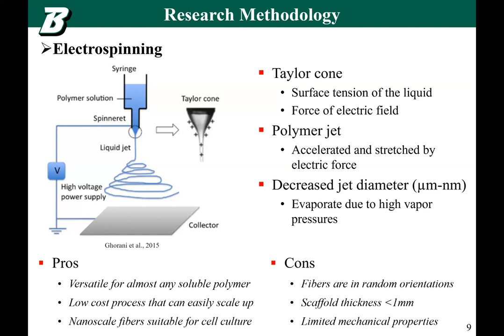The advantage of electrospinning is that it's versatile for almost any soluble polymers, and it is a low-cost process that can be easily scaled up, and the nanofibers are suitable for cell culture. Electrospinning can fabricate several tens or hundreds of meters of nanofibers in a few minutes. So it can be very efficient.